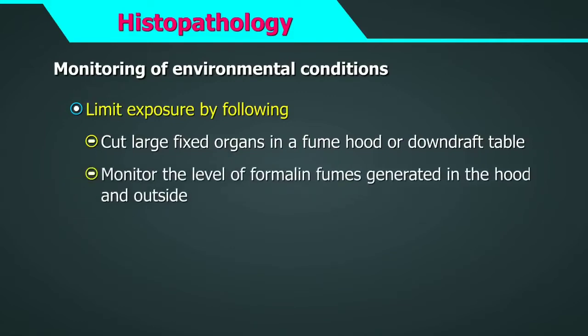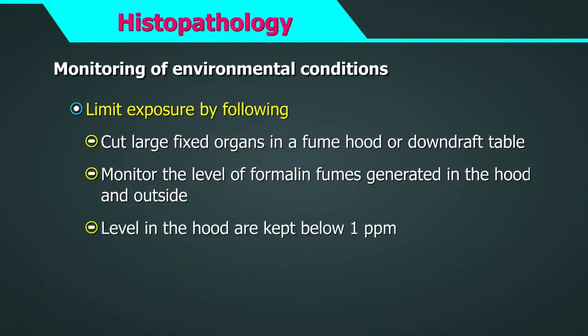Monitor the level of formalin fumes generated in the hood and outside by a formalin fume monitoring device, and the levels should be kept below 1 part per million.